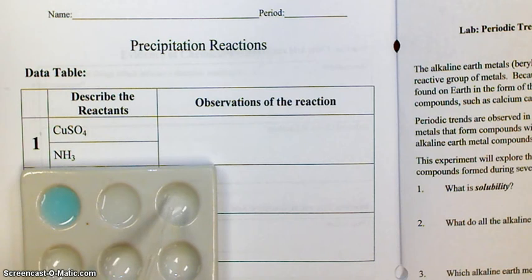And then over here I'm going to add some ammonia water. Okay, some NH3. And I'm going to put the copper sulfate in there. And you see that we get a definite color change. It may be a little hard to see in the video. Ooh, it's showing up now.